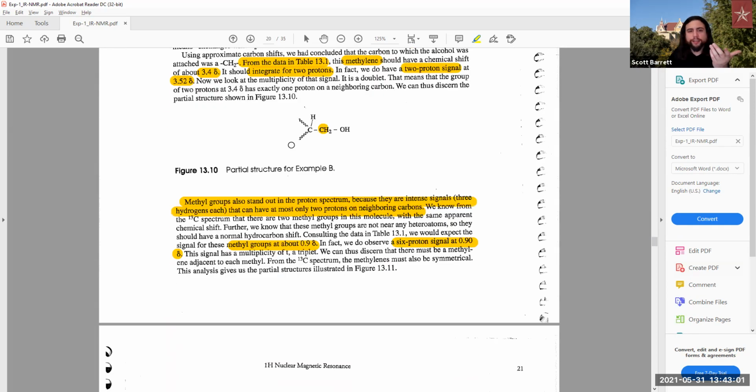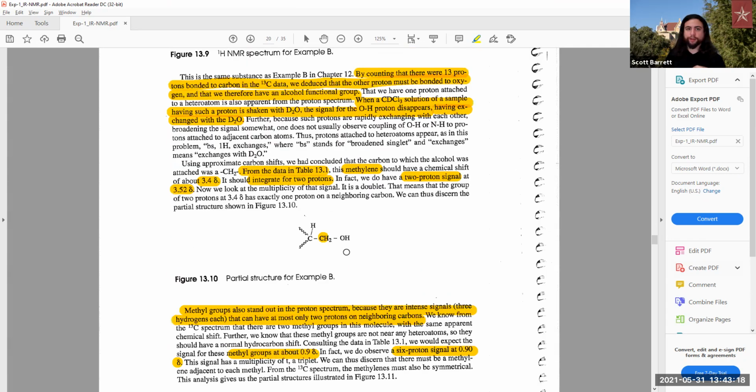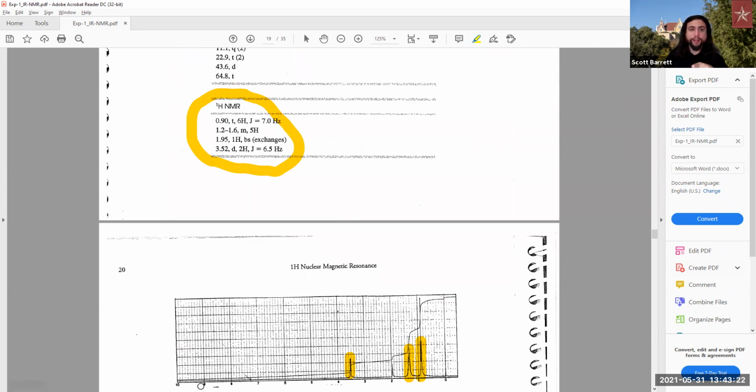How do you do that? 2 hydrogens here, 2 hydrogens there, and 1 here. So 5 hydrogens. That's why it's a multiplet: it's all in a grouping and overlapping within that little region. So there's your 5. And then finally, your methylene group. Your methylene up here is showing alone, and that methylene was the 2 hydrogens.